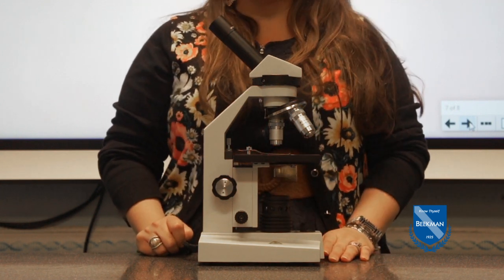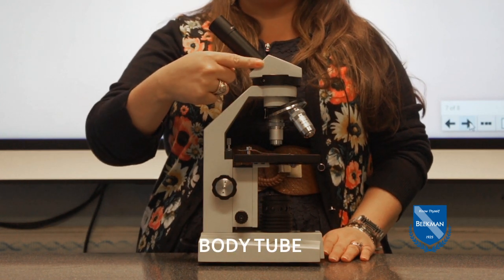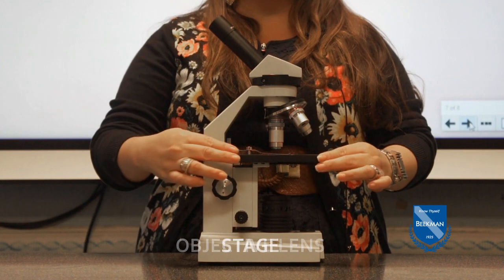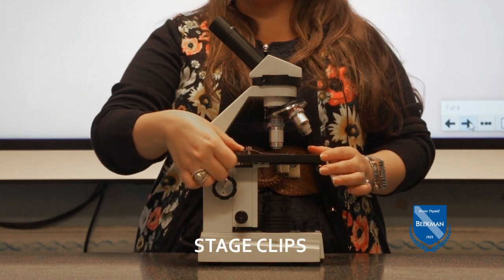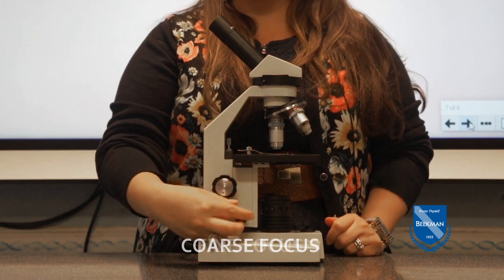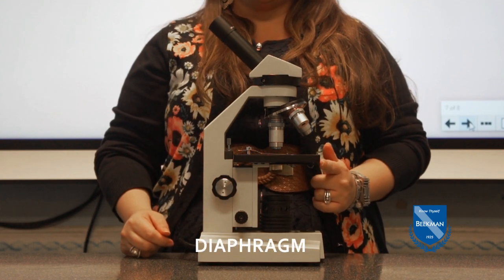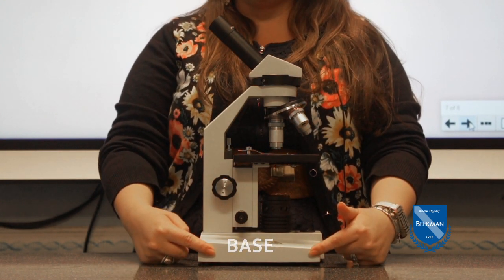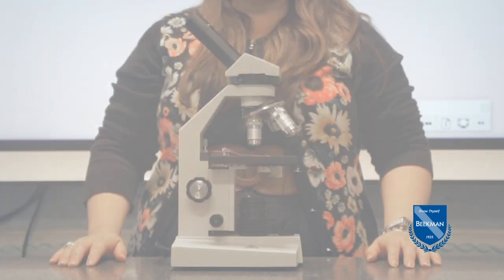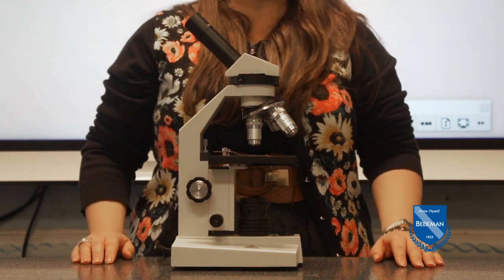So one more time, let's go through those parts. Eyepiece, body tube, revolving nose piece, objectives, stage, stage clips, arm, coarse focus, fine focus, light, diaphragm, and base. So you've got this, right? Simple, easy, no big deal. It's time for a quiz.